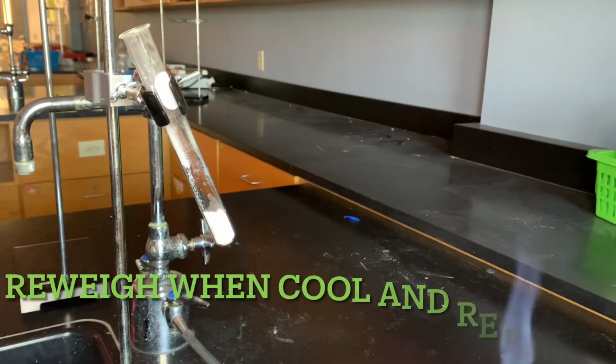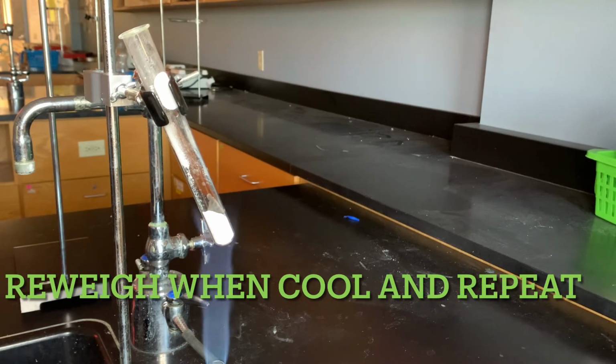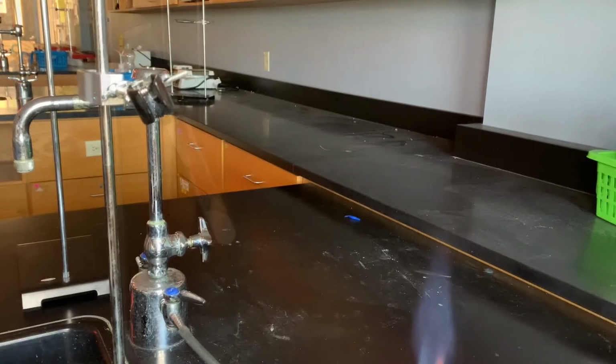So when you think you've completed this part right here, you're going to allow it to cool and then reweigh at the end. I recommend to repeat a second time and verify your results. And that can include either reheating a second time here or repeating with the second run completely. Your choice, I will let you select.